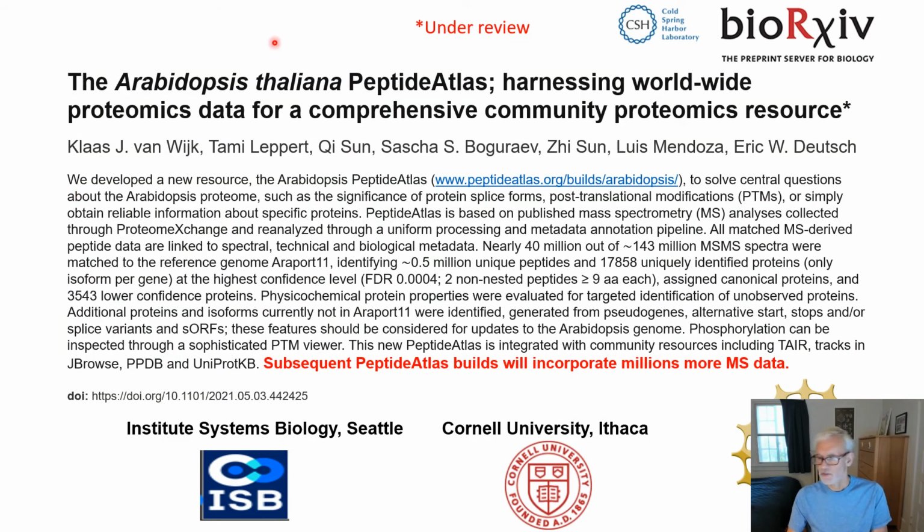So, of course, this is only 7 minutes, and if you're interested in more information, you can look at this preprint, and this article is currently under review. We are now working on the subsequent PeptideAtlas build, and this will incorporate millions more mass spec data.